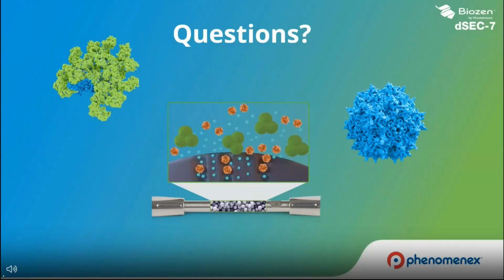Excellent. So we'll take one last question. This question is, are we in fear of shearing the AAV if we run at a higher flow rate?